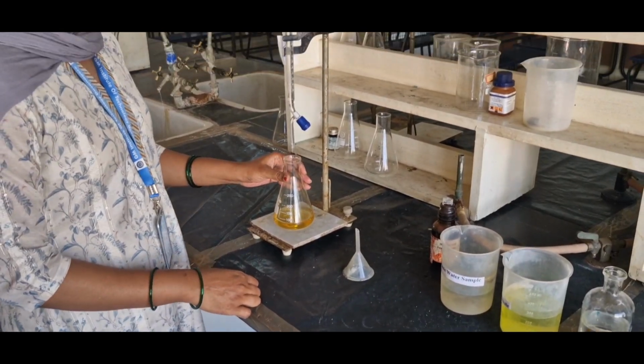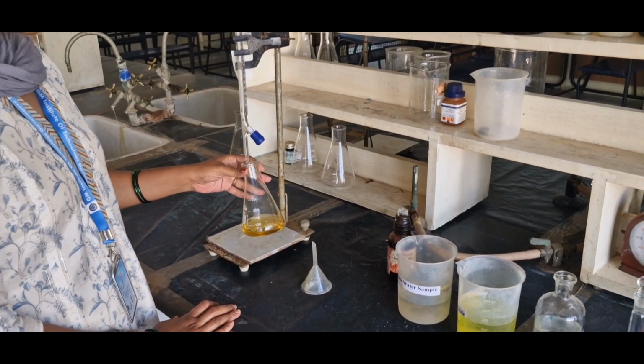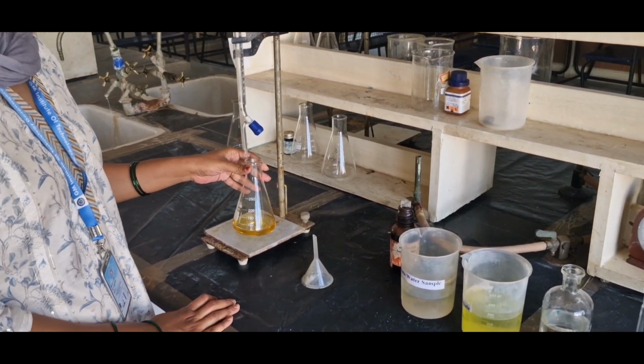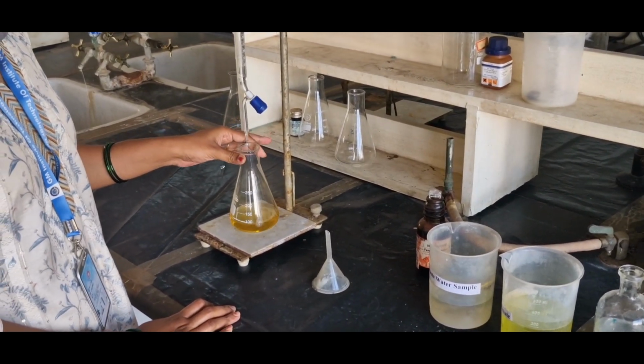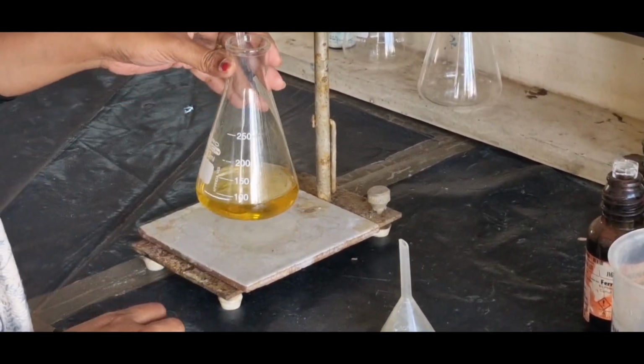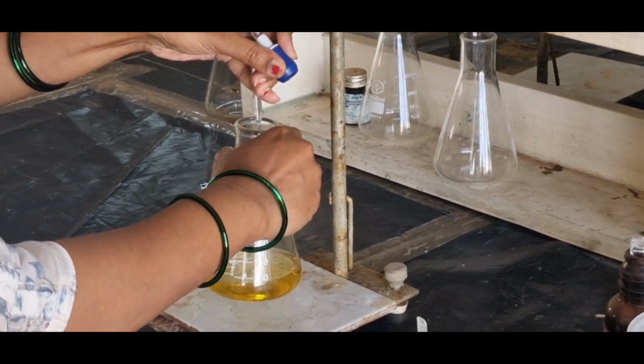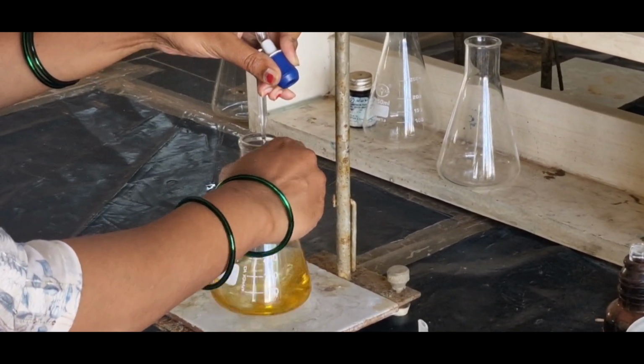Since the quantity of organic matter dissolved in this is less, we cannot see the intense bluish or greenish color. This will be yellow color. If we use some sewage water or highly impure water, we can see a clear or intense green-bluish color in this. Now I will start the titration. I have taken the FAS solution into the burette.